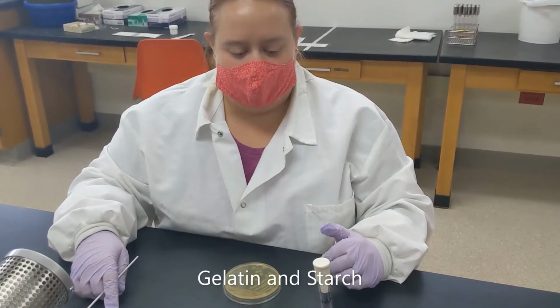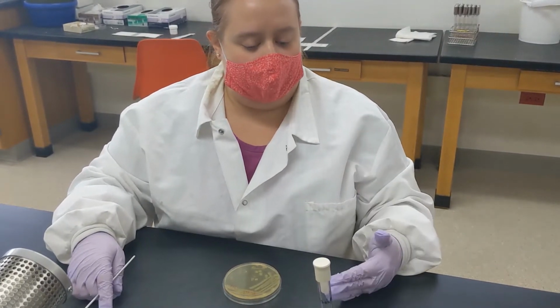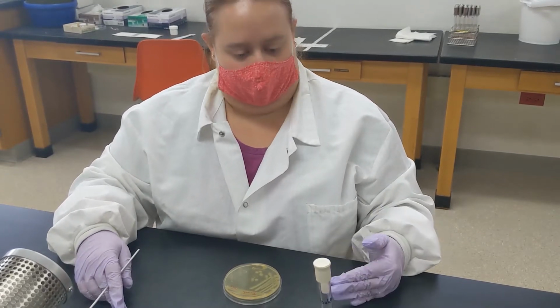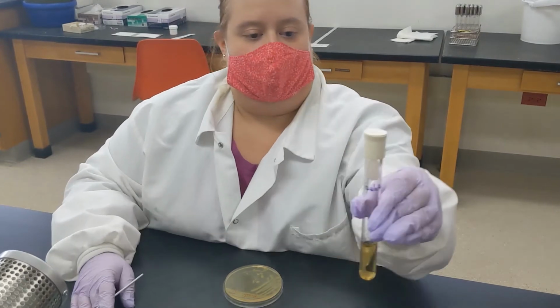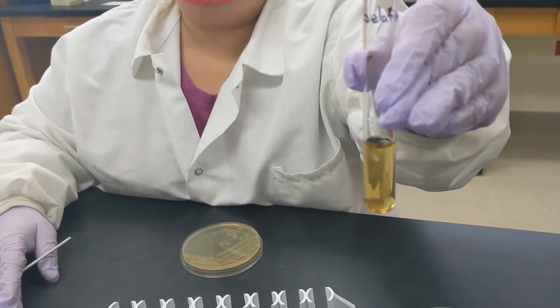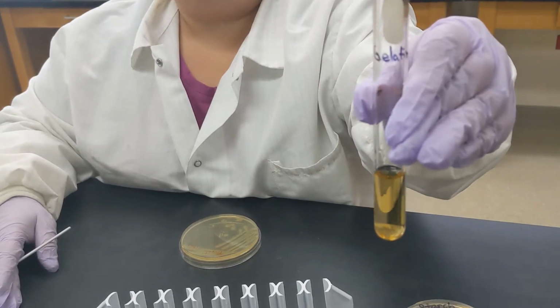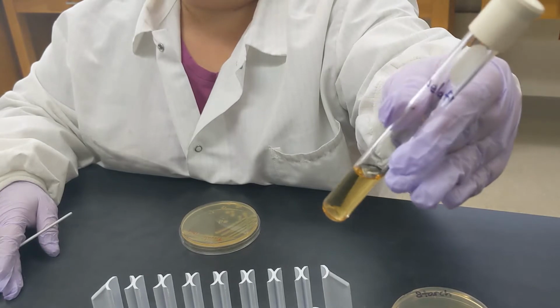Today, we are going to be inoculating cultures to look at the ability of our organisms to digest polymers. So the first one that we're going to set up is a gelatin test. This tube is going to contain gelatin, and we're looking for the ability of your microbe to break down gelatin. So gelatin is kind of like Jell-O.